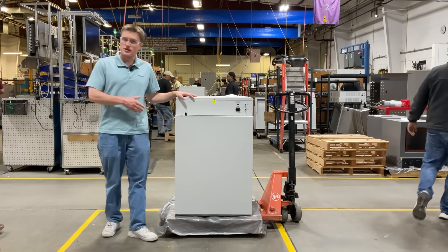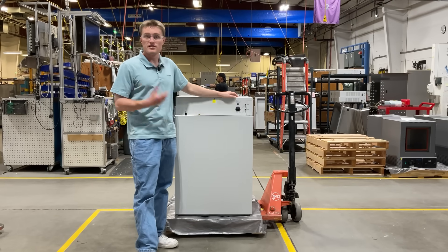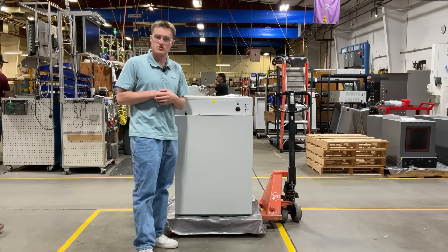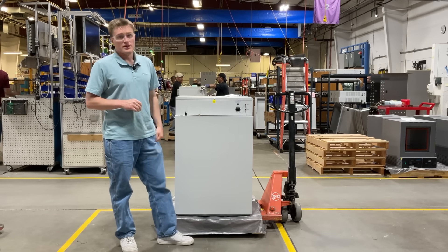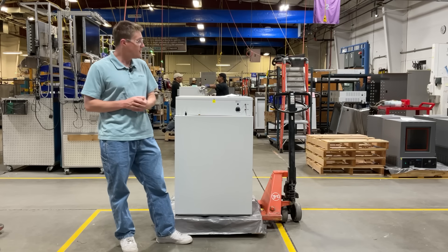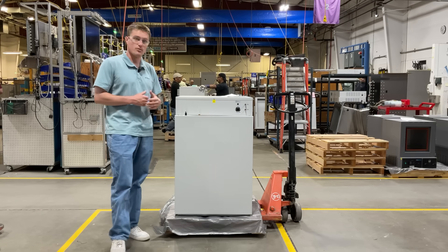Now, taking a look at the rear of the unit, the first thing you will notice is the main power inlet. This features an easily accessible fuse drawer to help assist replacement of the fuse should you need to do so. Each unit is included with a properly rated power cord in the ship kit. These units must be connected to a properly grounded electrical outlet for safe operation.